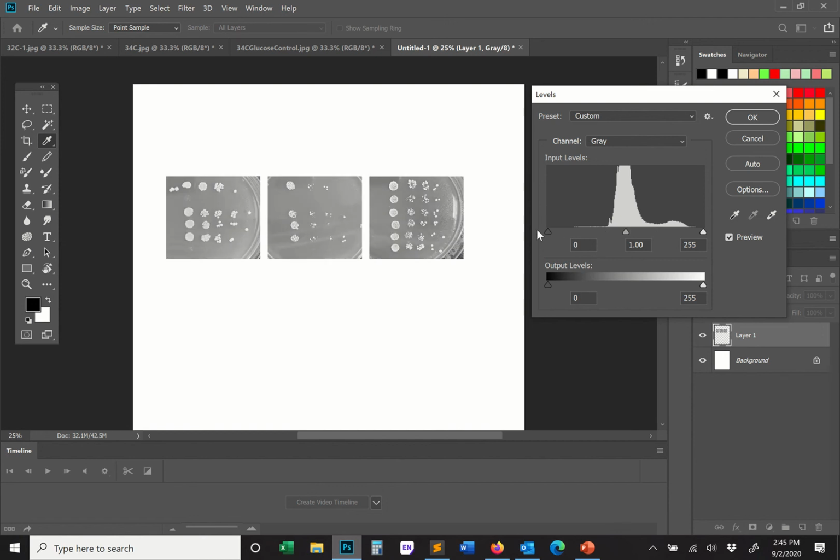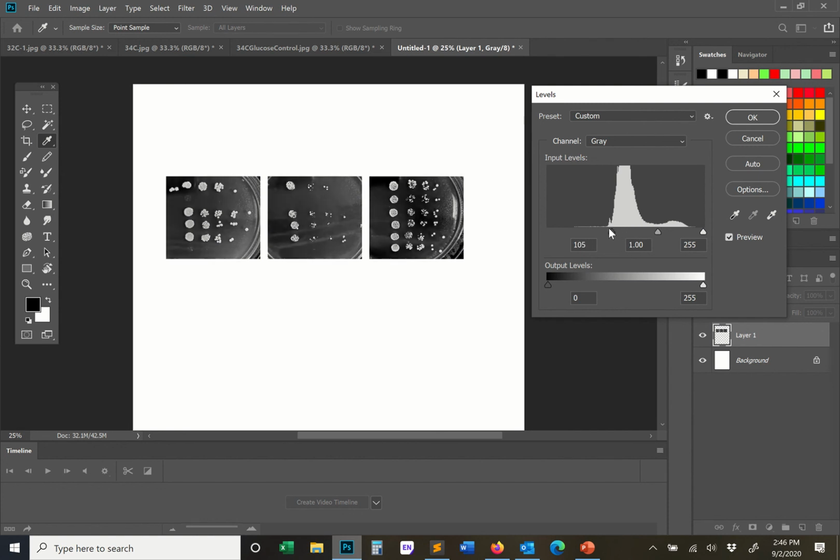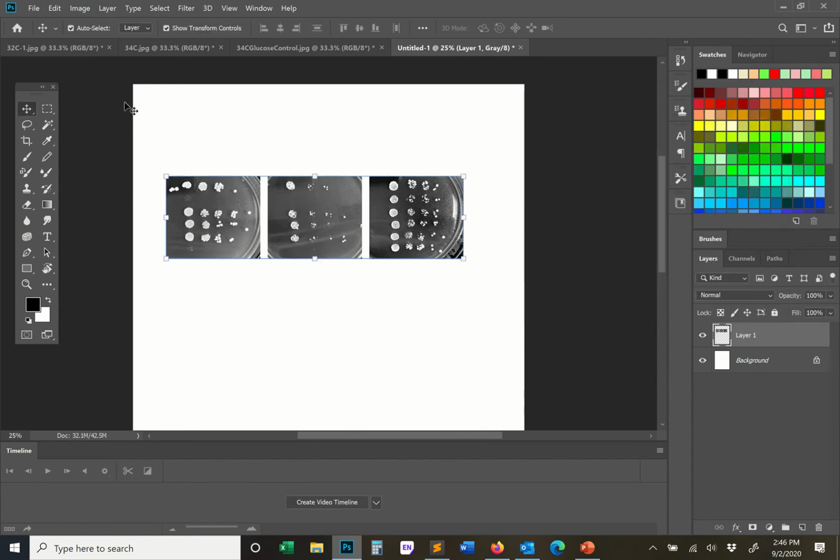So this is, again, a case, let me repeat, where contrast adjustment is going to have a big effect. And I'm pushing it to the point where I'm not pushing it beyond the point where the histogram is sort of showing the data. I'm pushing it just to that edge where it looks as good as it's going to get without changing anything inside the box. And I'm going to grab the whites. Again, make it a little bit wider. Now look at this. Now look at how nice that looks.